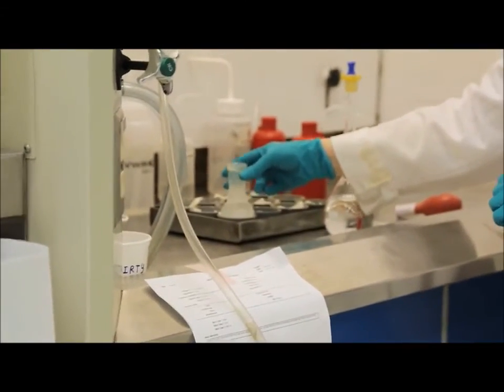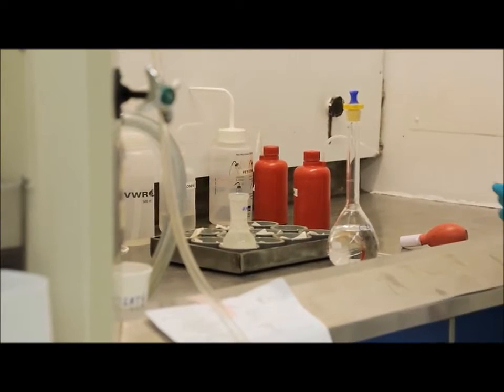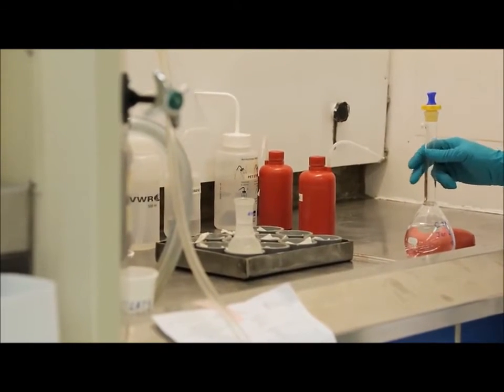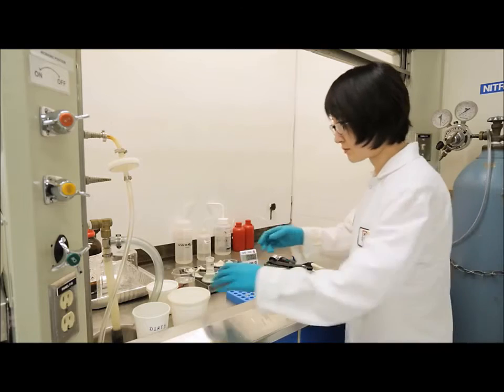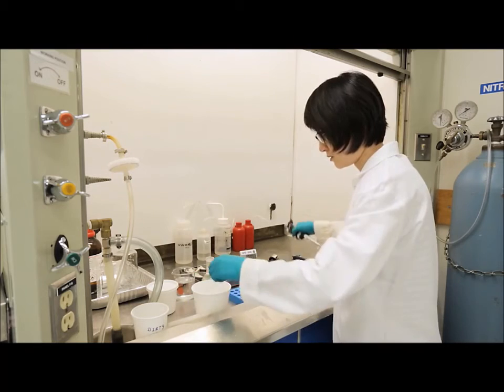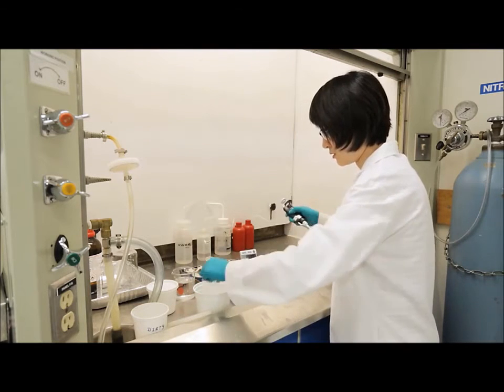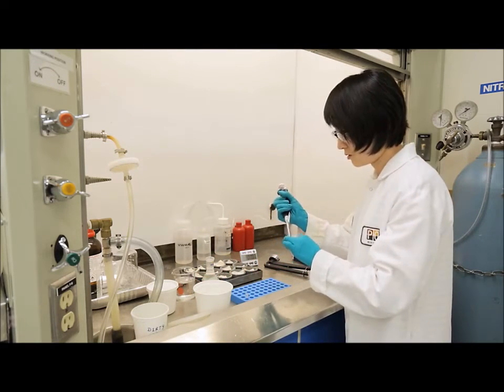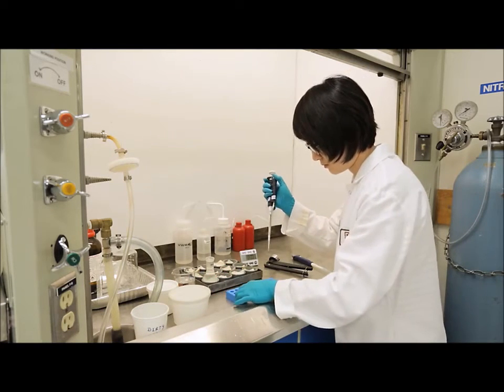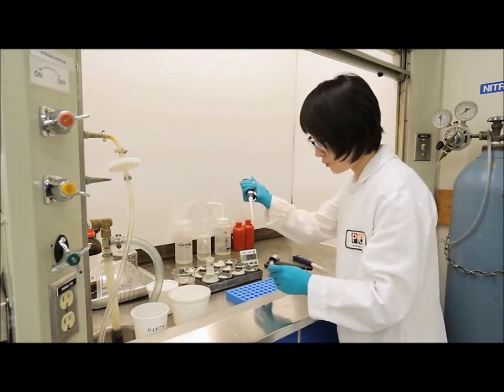Once you've added your saturated sodium chloride, we now need to let the sample sit. We want to let the sample sit until the top heptane layer becomes visibly clear. Once the layer is visibly clear, we can now subsample from the heptane layer into a GC vial to run the sample on the GC.